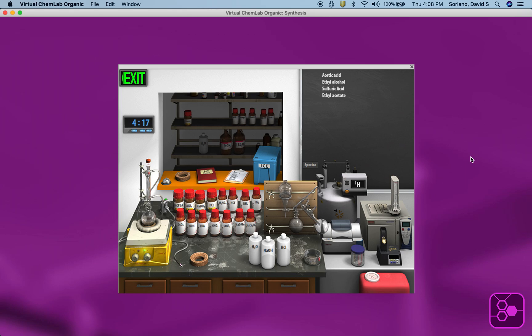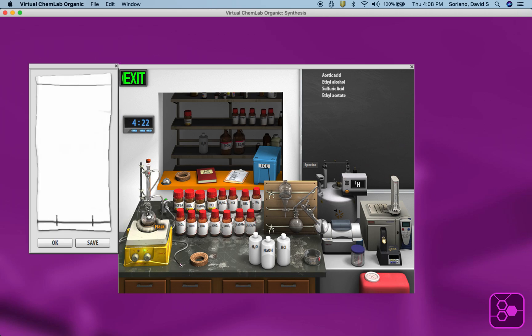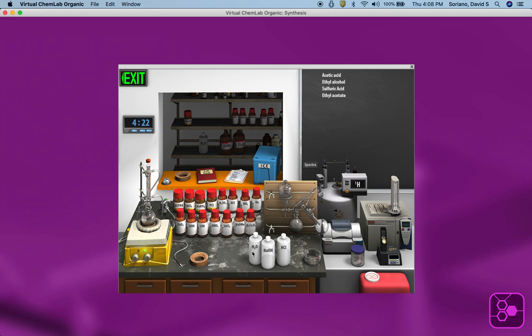It is a really very impressive program that was put out by chemistry professors at Brigham Young University. I'll fill in some of the other details. When you get done with the reaction, there are workup reagents, a separatory funnel, distillation, rotary evaporation — very, very impressive. Okay, bye for now.